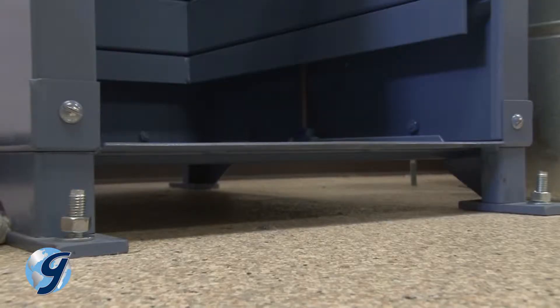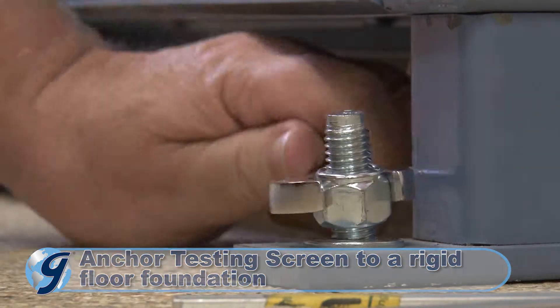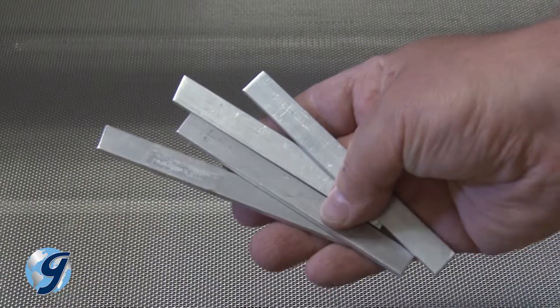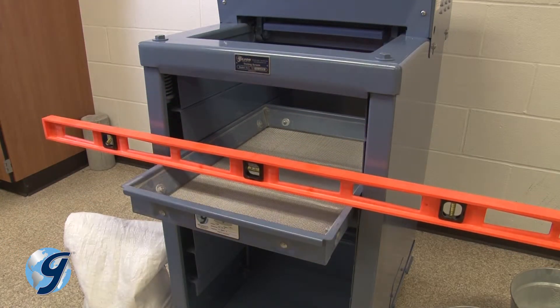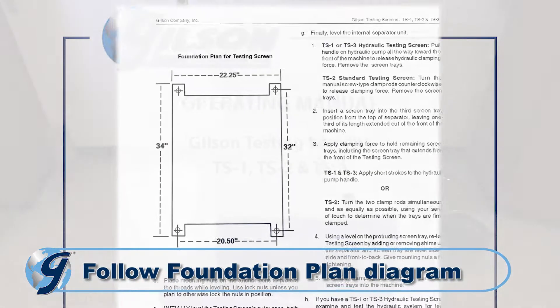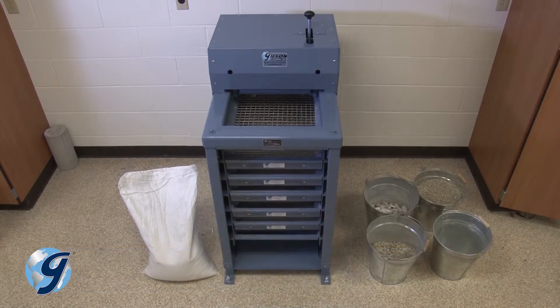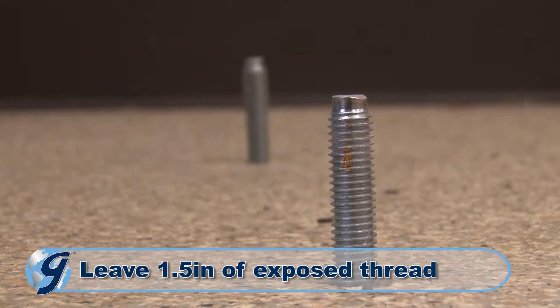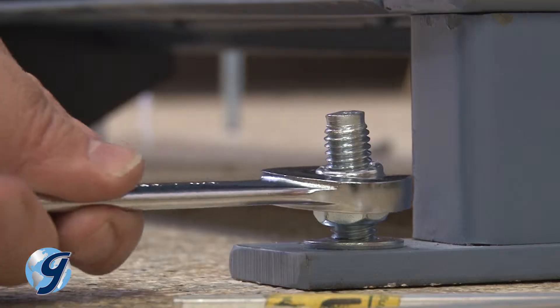Gilson recommends anchoring the unit to a concrete floor using half-inch anchor bolts and locking nuts. Be sure to have metal shims on hand to level your testing screen. Install your anchoring hardware using the foundation plan for your testing screen found in your operating manual. Leave about one and a half inches of exposed thread to allow for leveling shims and securing the unit's feet.